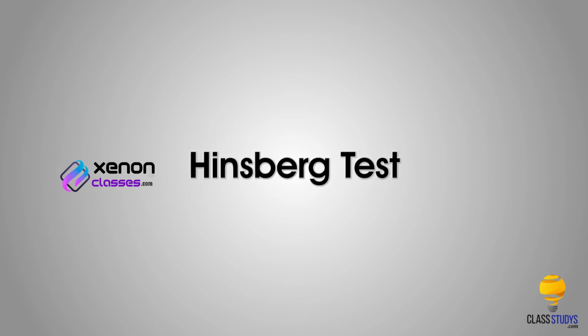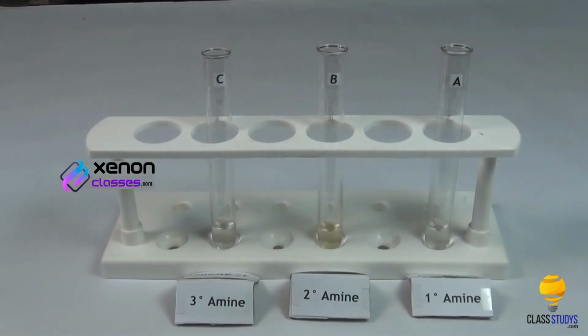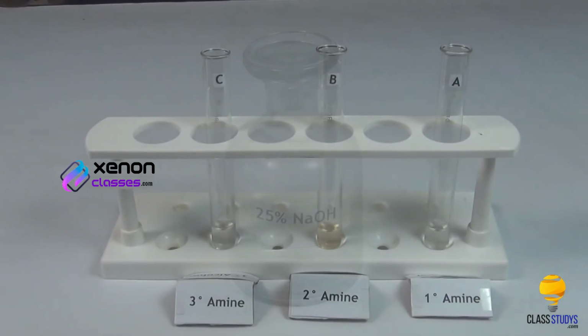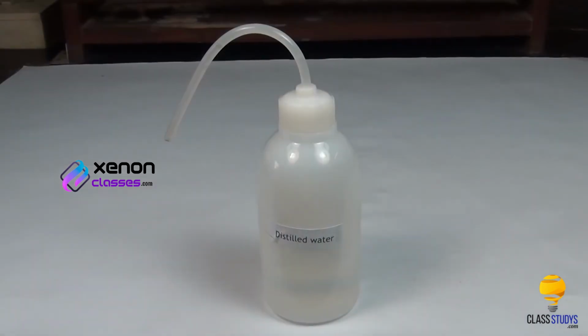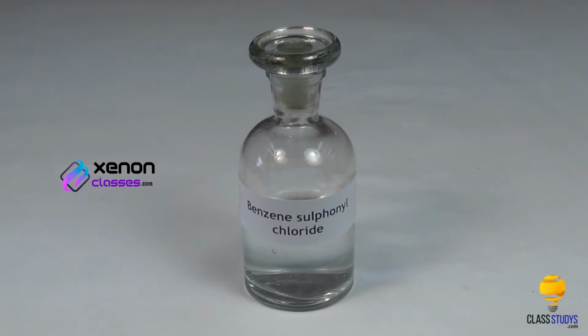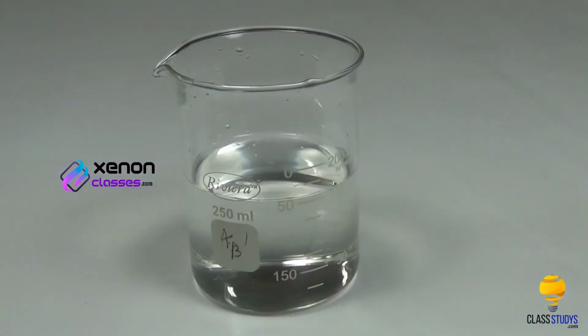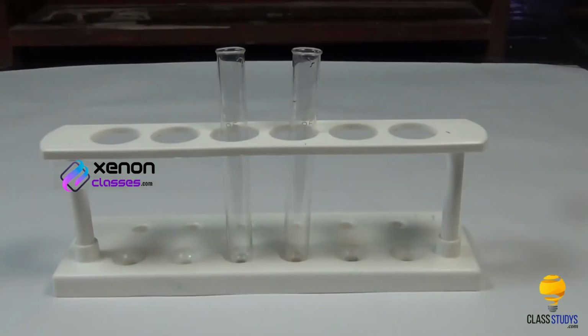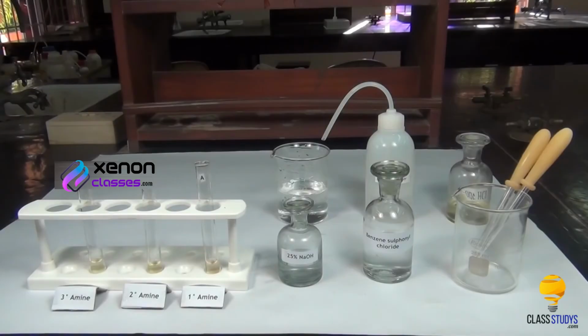Hinsberg test. Materials required: primary, secondary and tertiary amines, 25% sodium hydroxide solution, distilled water, benzene sulfonyl chloride, concentrated hydrochloric acid, water in a beaker, test tubes and droppers. Procedure: take small quantities of primary, secondary and tertiary amines in test tubes A, B and C respectively.